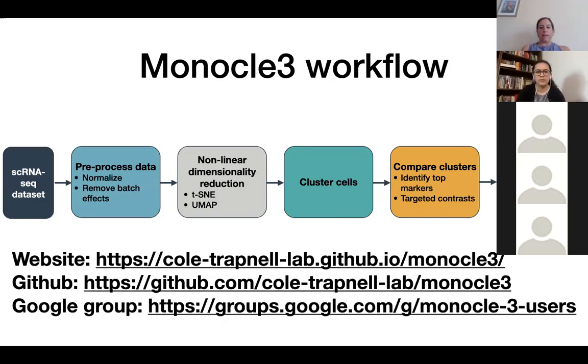This is the general workflow of Monocle 3. If you've gone on the website, you would have seen this. These links are for the Monocle 3 website, the GitHub repository, and the Google group for questions. So please feel free to post anything that you may need help with. The team is generally on it most of the time when they're not busy with other things.